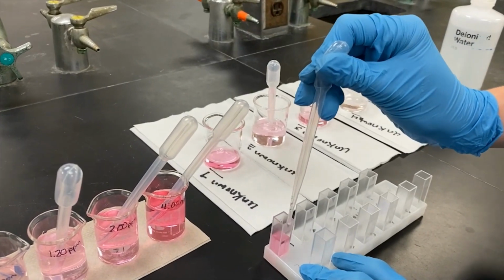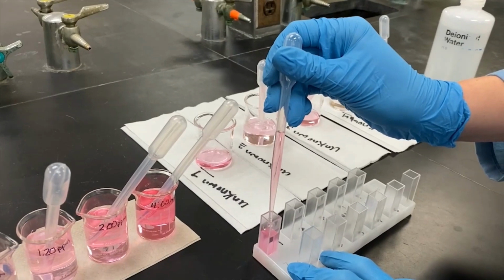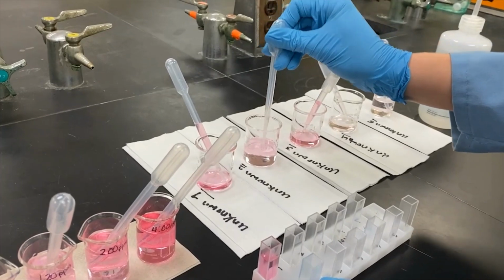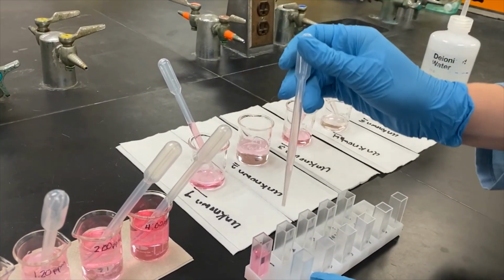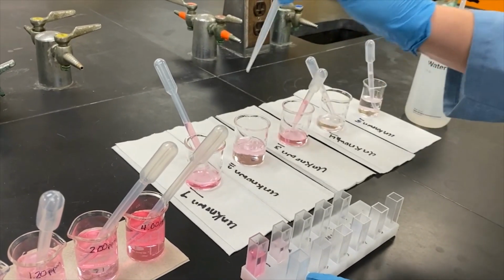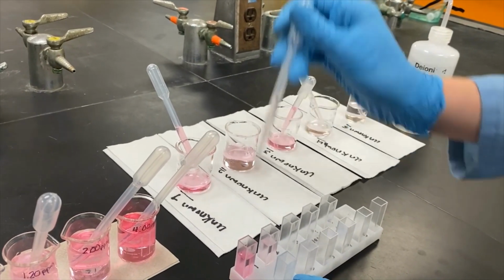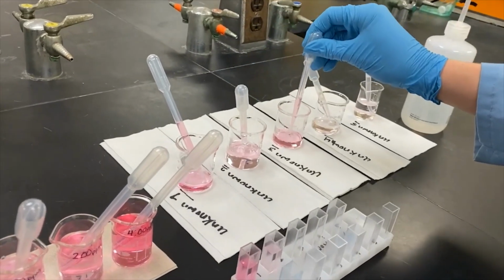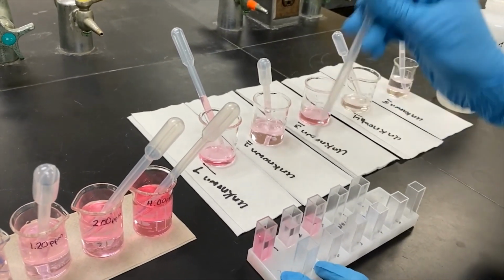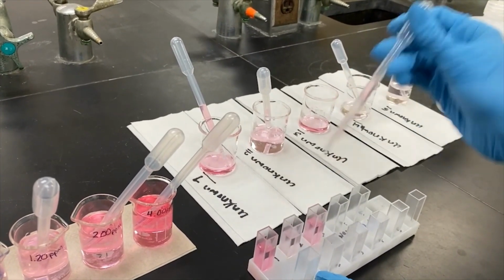And what's nice about the cuvettes too is it helps you compare and make observations about the different colors you see. And so this is a really important time to make sure you know the difference between colorless and clear. And if you have proper observations about the solutions, it might help your discussion later be a little bit more thorough. And it may help you explain different trends that you see.